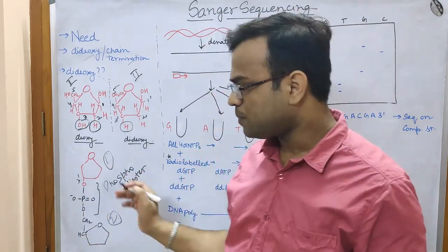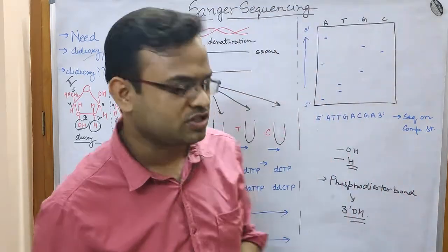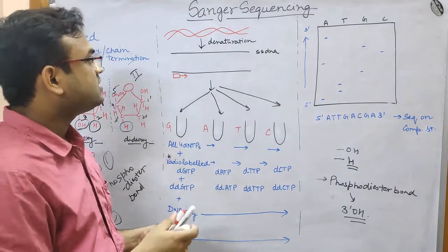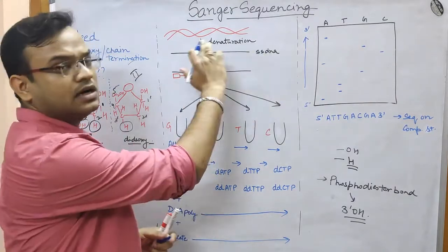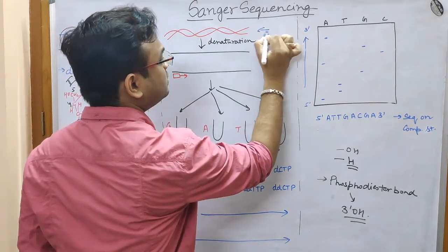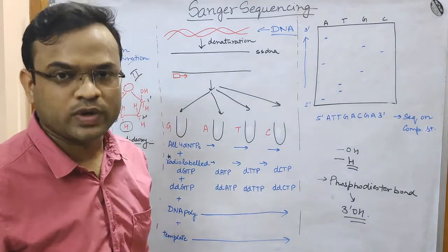So let us now go, after understanding the principle, let us now move forward towards the procedure. Okay, now let us understand the procedure. Suppose this is the DNA strand that you want to sequence.